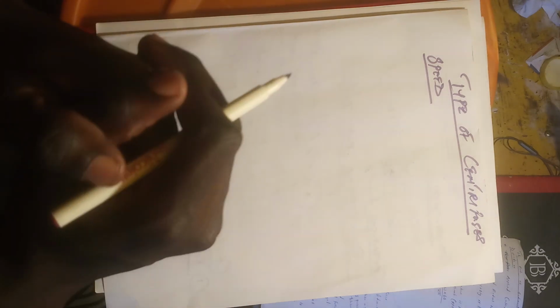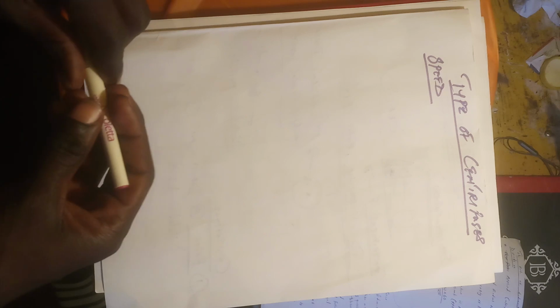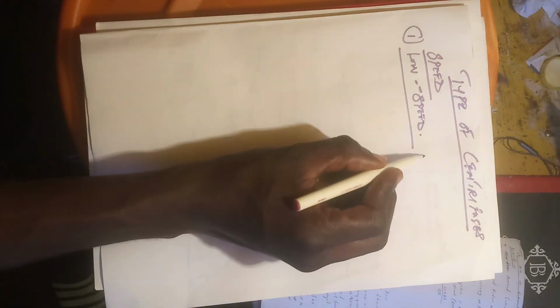So types of centrifuges, there are many types, but depending on speeds, we can classify them into 3 or 4 types. But in here, I'm going to just highlight the 3 main types of centrifuges, which are: the low speed centrifuge, then the high speed, and the ultracentrifuge. But we can start with the low speed. So 1 is the low speed centrifuge.